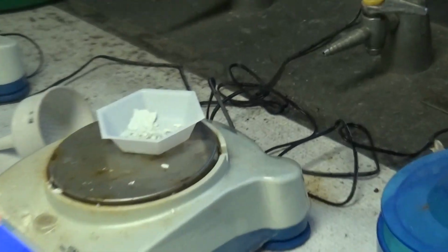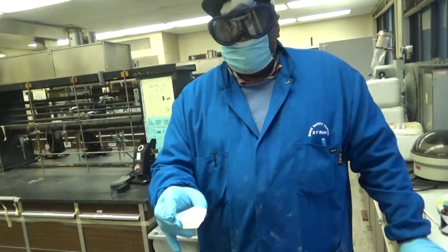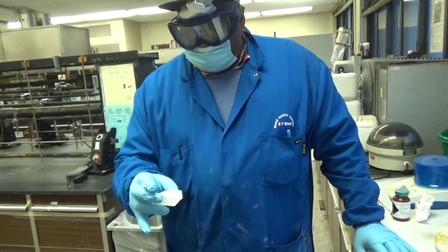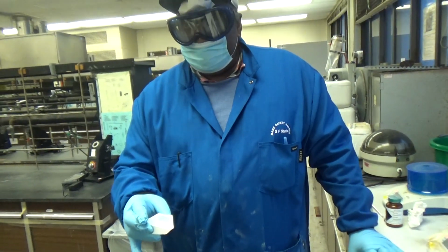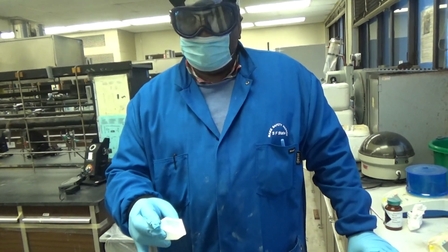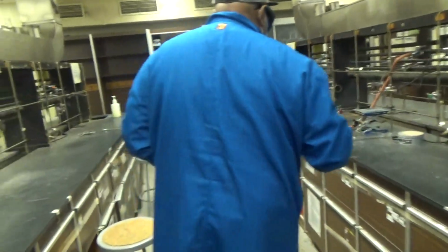Alright, so we have our crude product. What we have here is a crude product. We are going to purify that. We started with 0.94 gram of crude product before the purification. After the crystallization, we need to have an amount of pure product less than 0.94. That's very important to know. You shouldn't have the same amount or more.